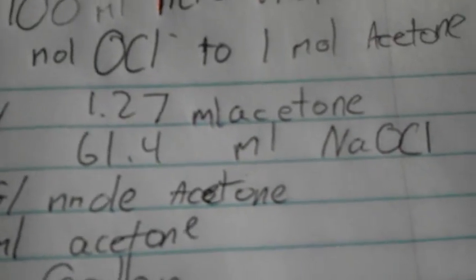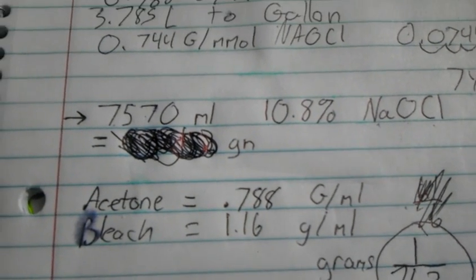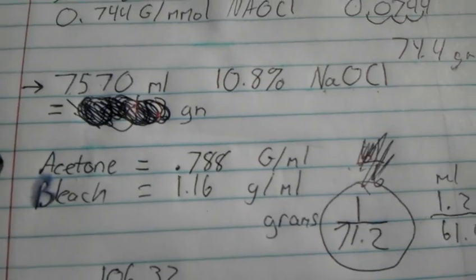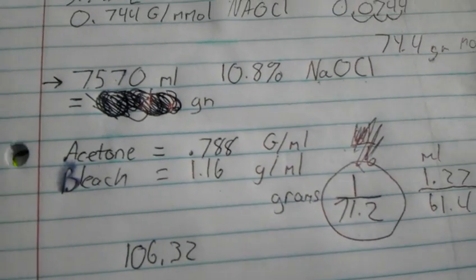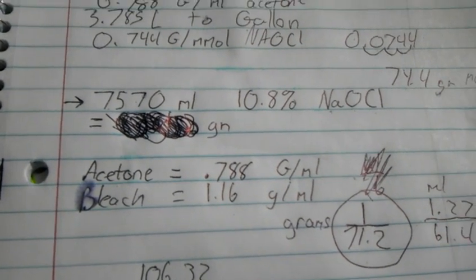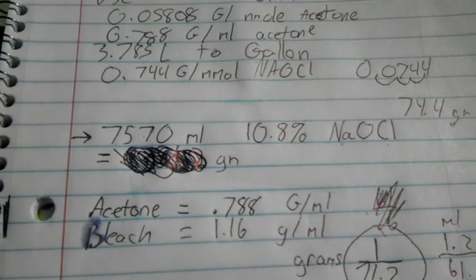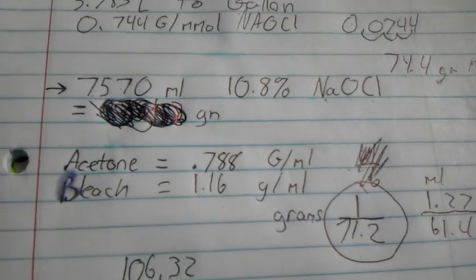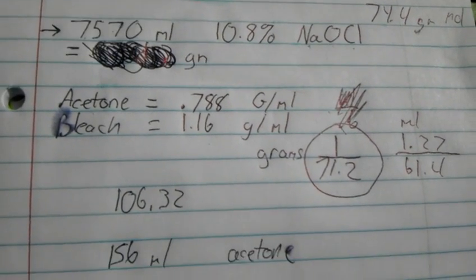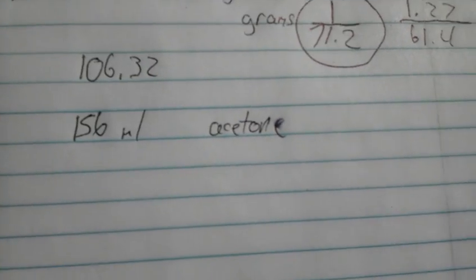We're assuming that you're using 10%. I'm using 7,570 milliliters of this, and it's pretty much a 1-in-48 ratio. So you're going to use 1 milliliter of acetone for every 48 milliliters of 10% sodium hypochlorite. That leaves us with about 156 milliliters of acetone.